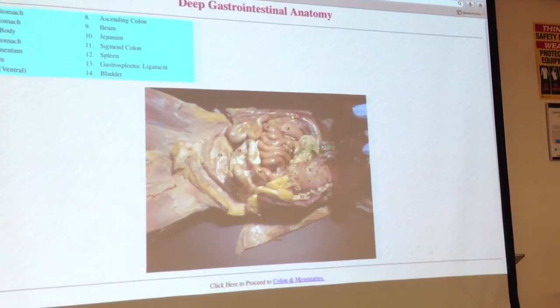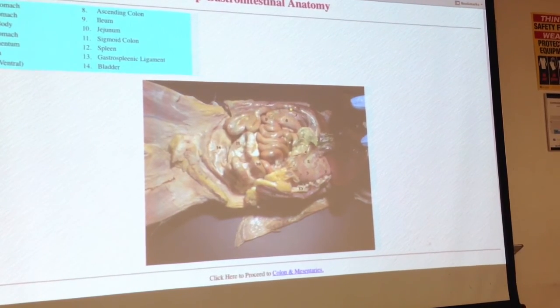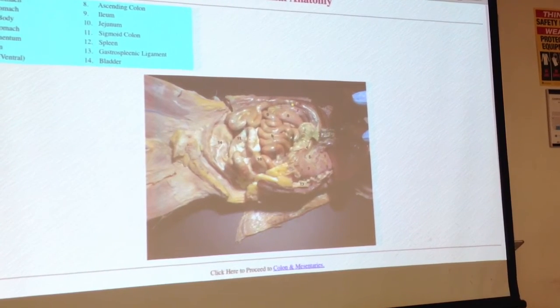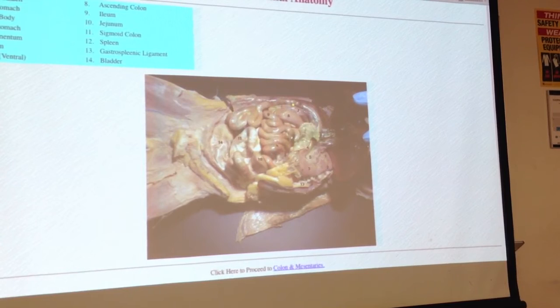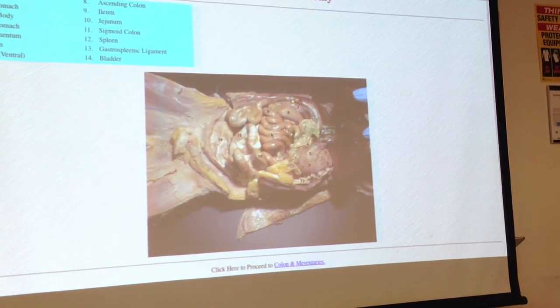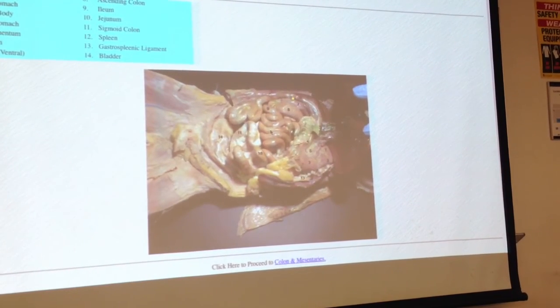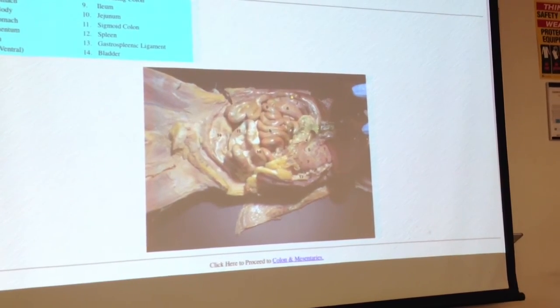Okay, so I'm going to finish my explanation of the small intestine now. Again, the duodenum is going to be in view of the stomach, close to the stomach. If we're asking for the jejunum, we're not going to be showing you whether it's close to the stomach or the large intestine. We're just going to be pinning it just like that. If we want you to identify it as the ileum, we're going to be showing it to you as connected to the large intestine.